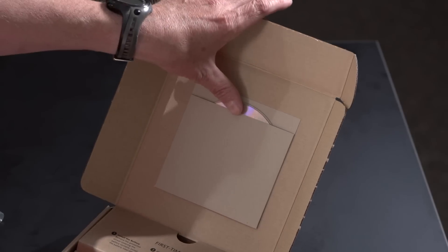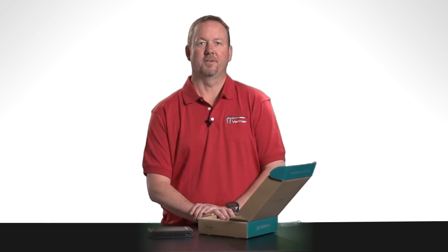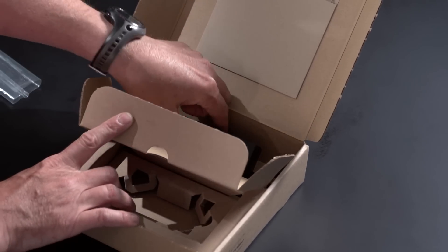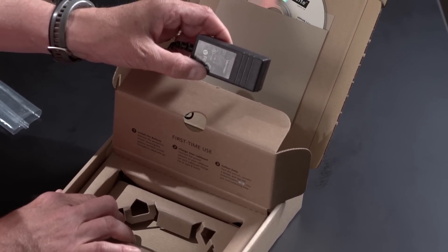And in this pocket on the lid is the LoggerLite CD. This is the software used when you connect LabQuest 2 to the computer for data collection or for file transfer. In this compartment you'll find the AC adapter. This is used to power LabQuest or to charge the battery.